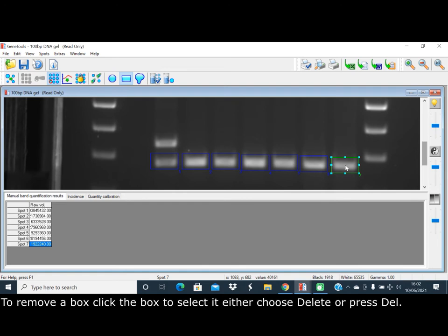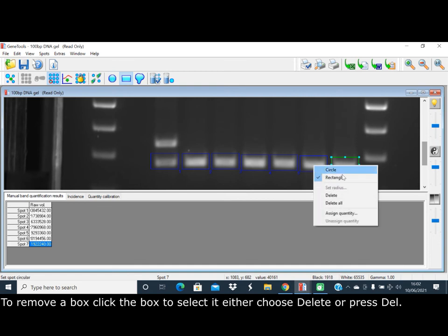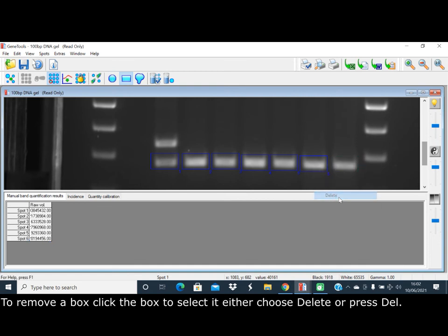To remove a box, click the box to select it, then either choose delete or press delete.